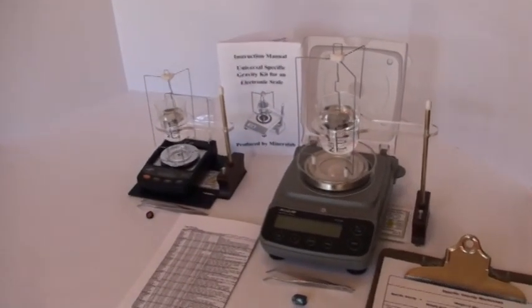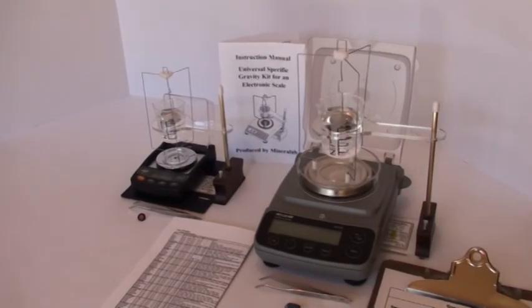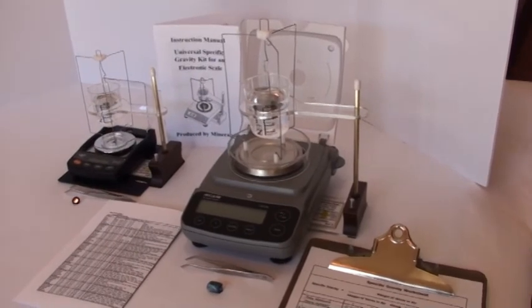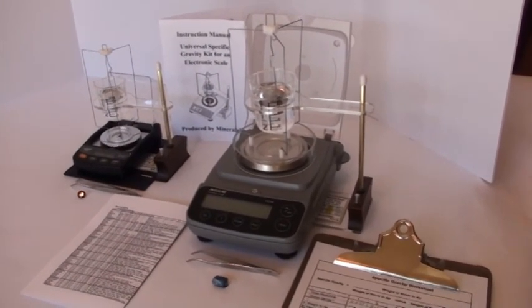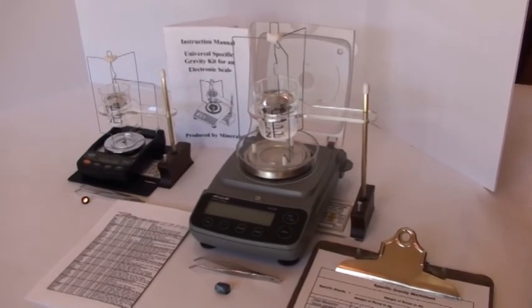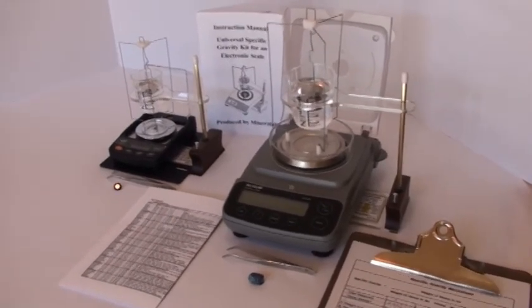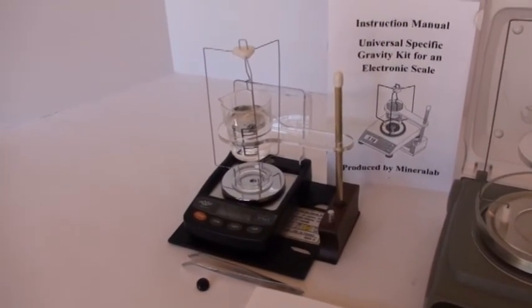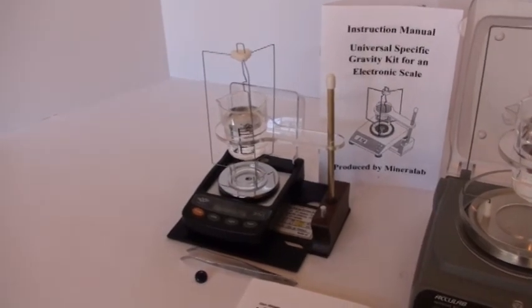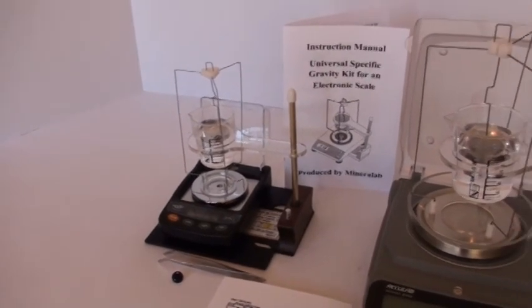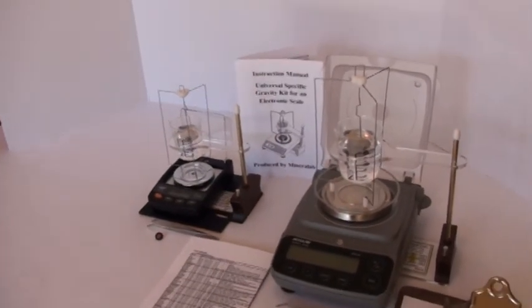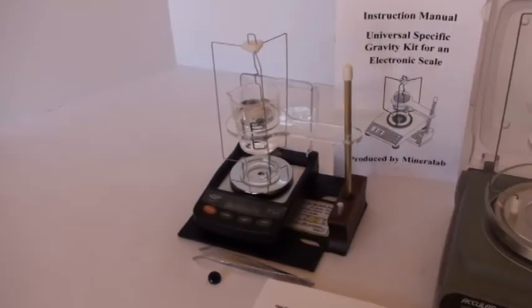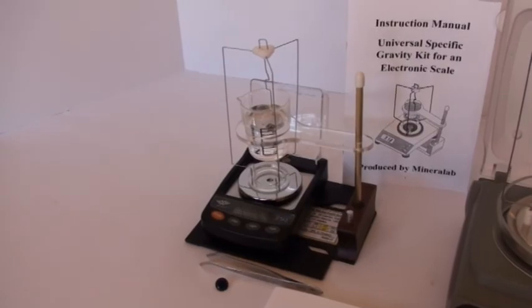Now in the presentation, you can see we actually have two versions of our kit. On the right is what we call the bench scale version of our specific gravity kit, designed for bench scales or lab scales. On the left is our SG kit for a pocket carat scale, often used in the gem and jewelry trade. The components of our two versions are virtually identical, but we had to downsize those components to match the smaller capacity of a typical carat scale.